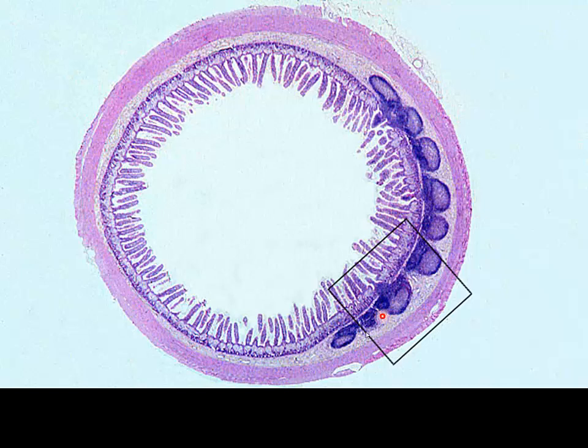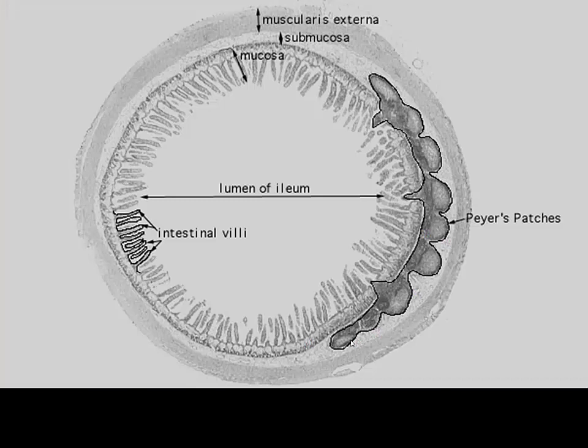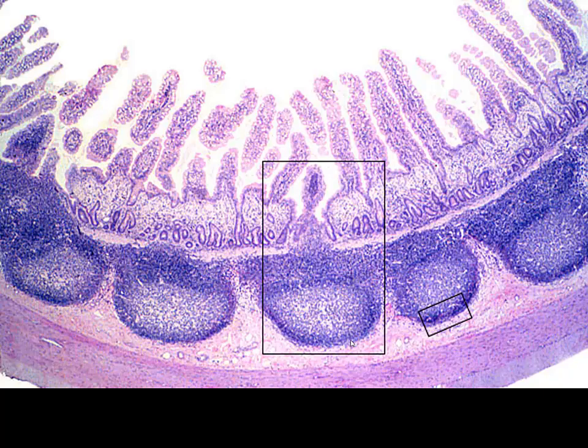And when you see these secondary lymphoid nodules and the other characteristics that we know as alimentary canal and really small intestine, then we're going to know that these are called Peyer's patches, secondary lymphoid nodules called Peyer's patches, and they are present in the segment of the small intestines. It's called the ileum. And again, these are permanent structures. They're not temporary, much like we saw with our diffuse lymphatic tissue.